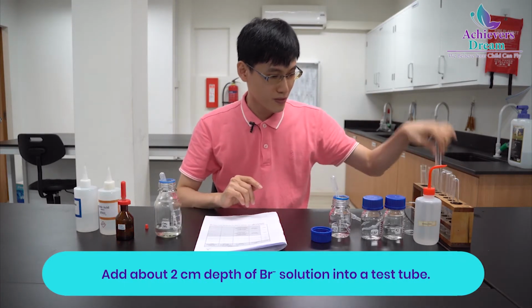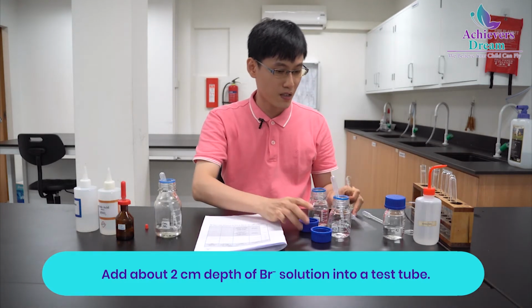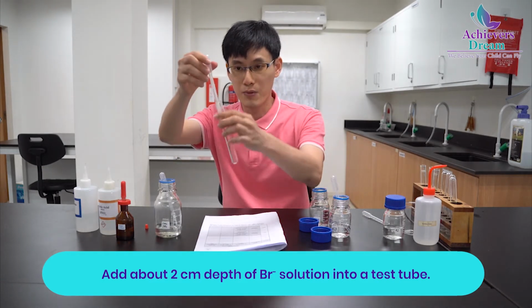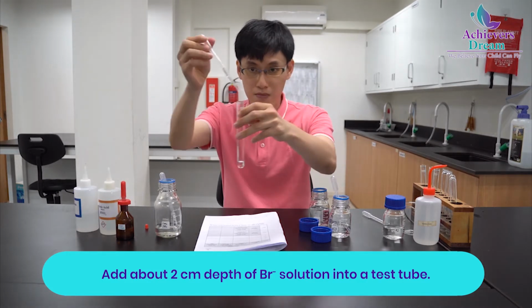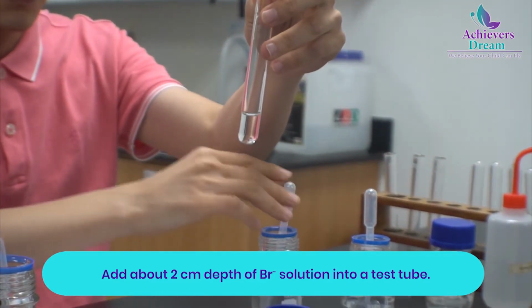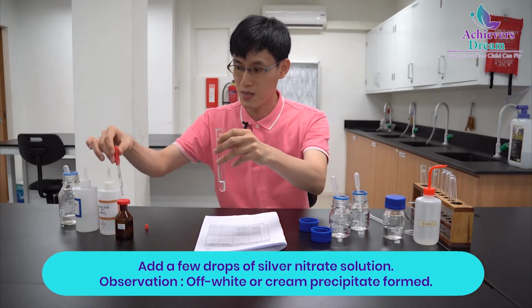Let's do bromide now. So we're going to do the same thing. 2 cm depth of bromide. The solution is clear too. Silver nitrate is coming in.